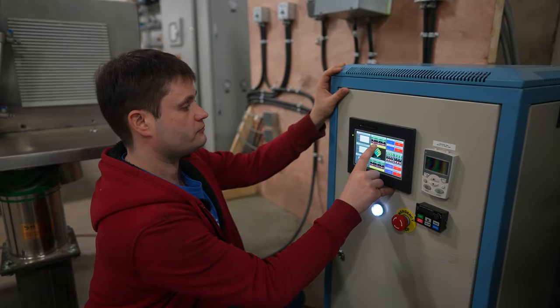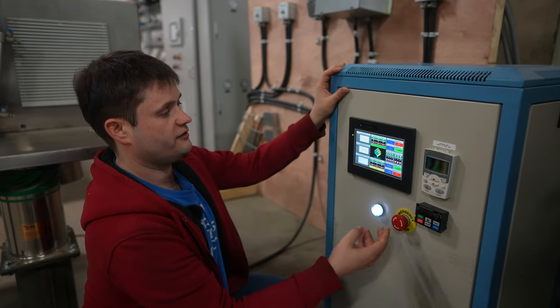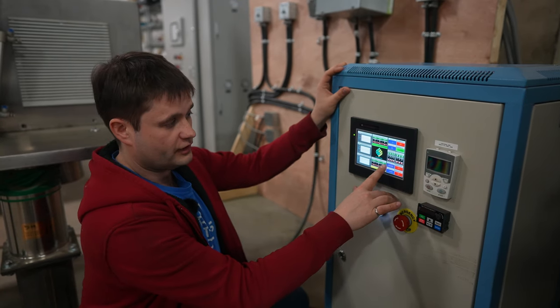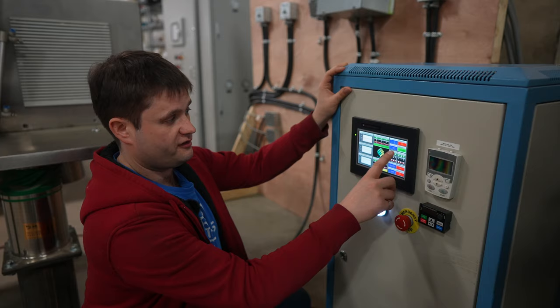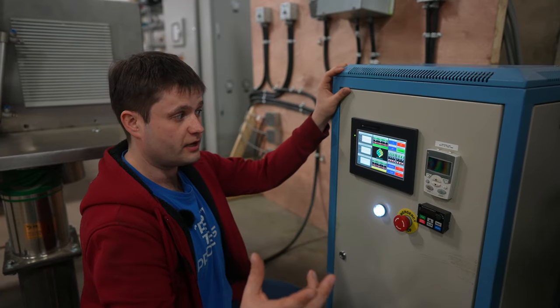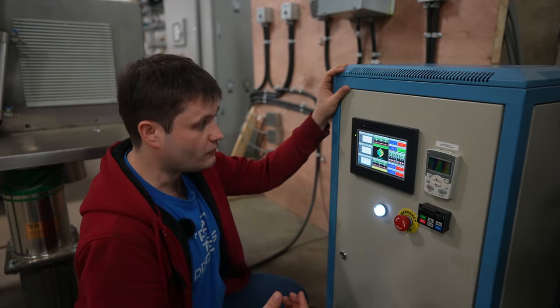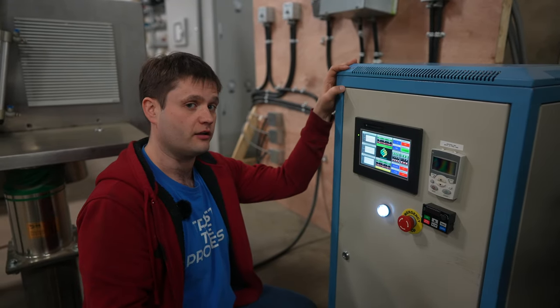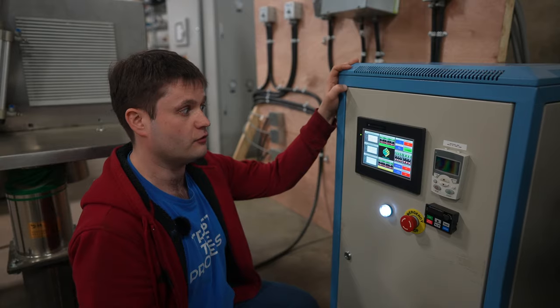I'll give you an example. Run. You see that it started the centrifuge. Once it's done filling, it turns the pump off, spins the centrifuge up to full speed — 1,000 RPM — and it will now spin and dry for 120 seconds, then stop automatically.